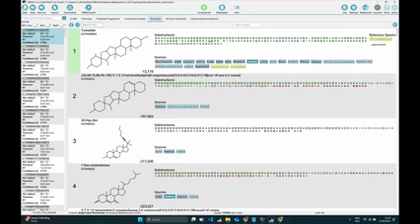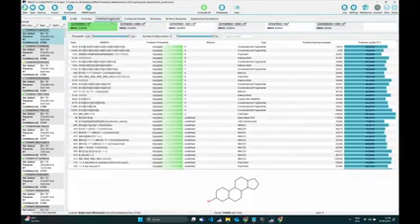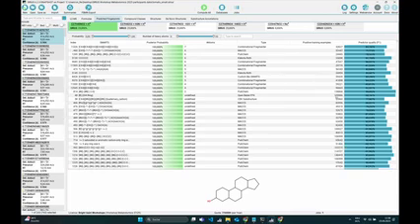So here we can see we have many green squares, and a green square means that this particular substructure, which is contained here, was predicted to be present, so this is a very good sign. But if we had, for example, such a red square, so we now go to the second hit and just click on this, which will highlight this part in the second structure hit, this is something that we didn't predict to be there, so this is a bad sign if we get a lot of these red squares. And what is also important is the size of these squares. So the larger the square is, the higher the predictor quality is. This is just this F1 score, which is in the last column of the predicted fingerprints.